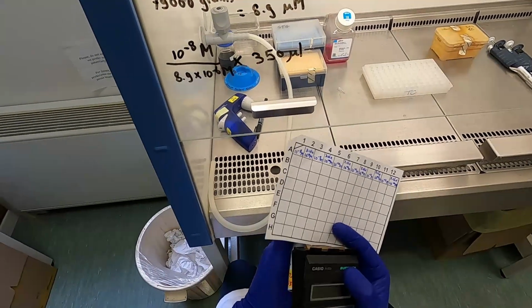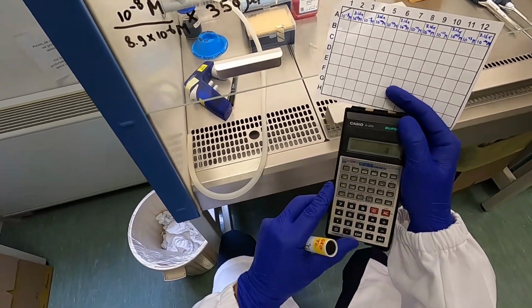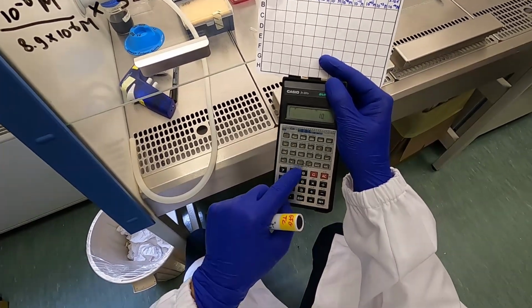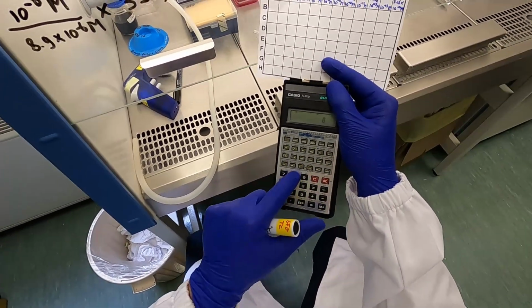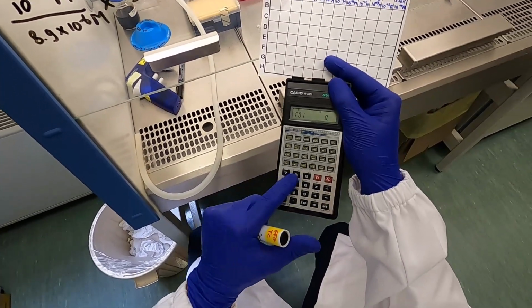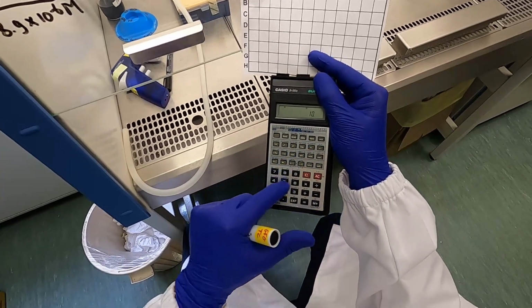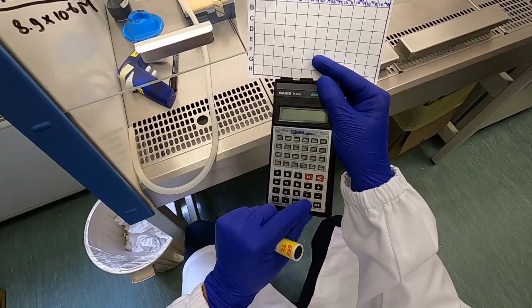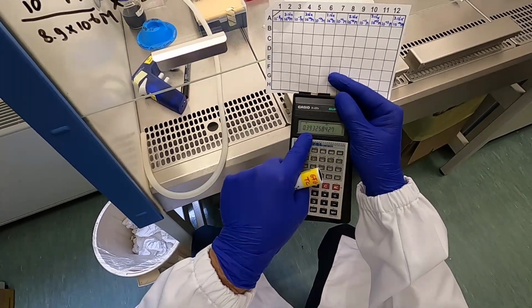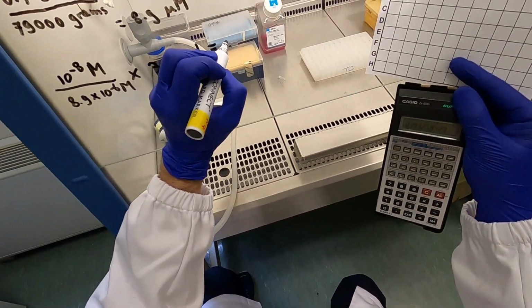And here you write 350 microliters, but in fact that would give you a pipettable volume of, let's see, very, very, very small volume, 0.39 microliters.